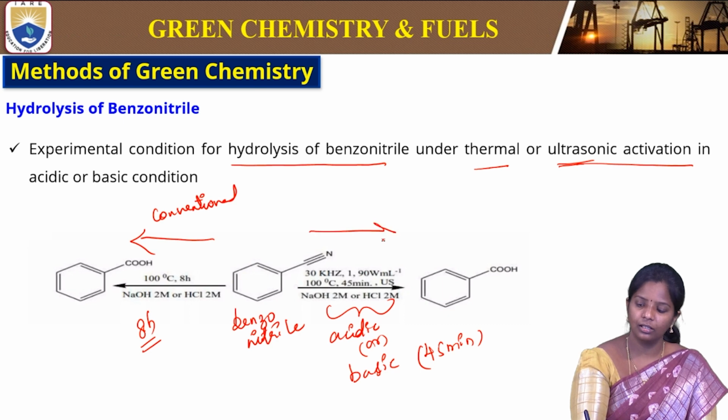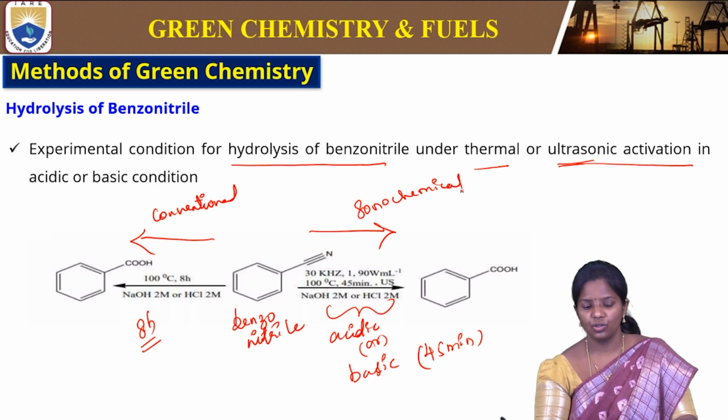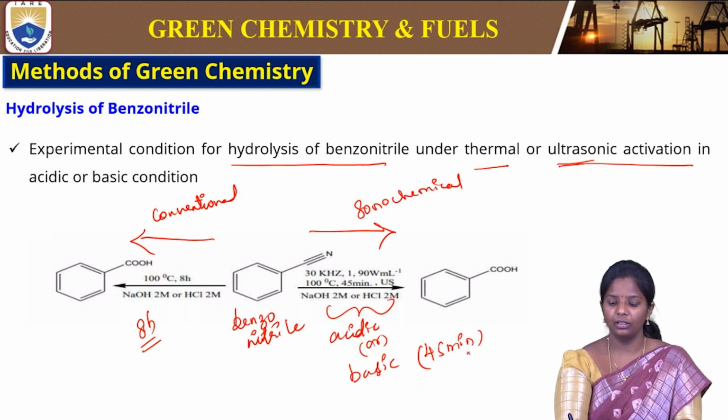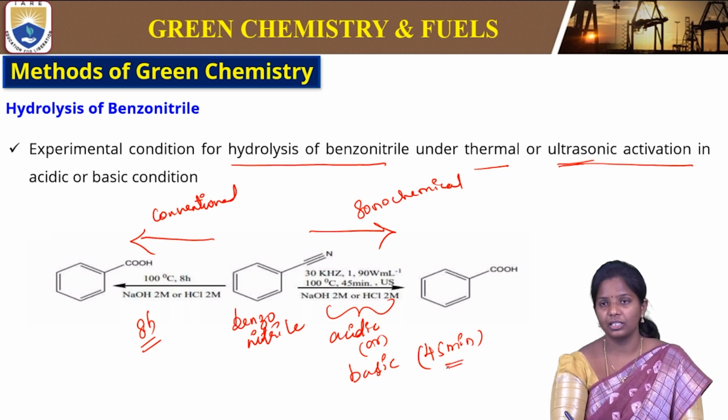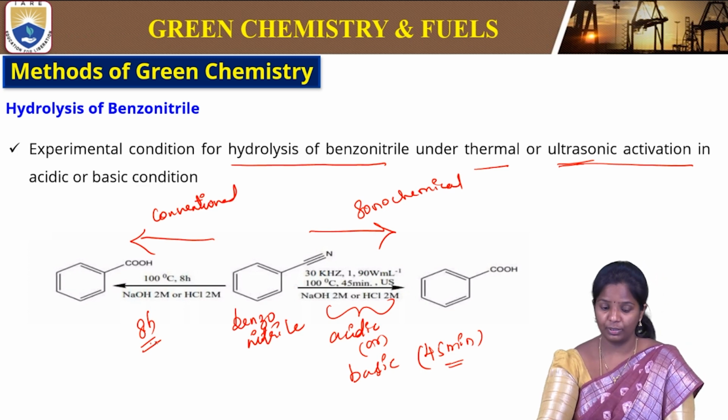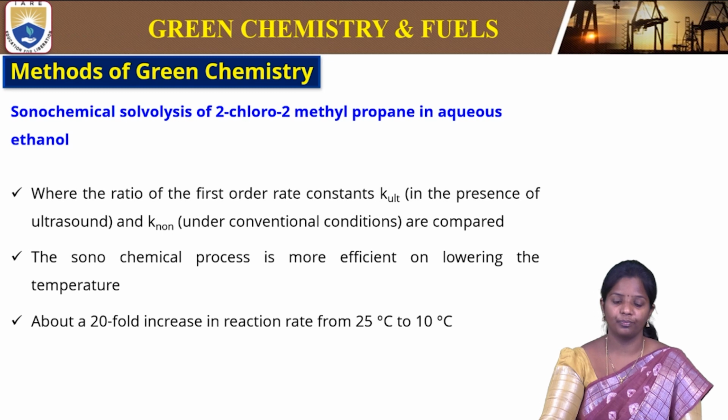This is the sonochemical method, or ultrasonic activation. So the two methods are the conventional method and the sonochemical method. Here it takes only 45 minutes, however it is 8 hours for the conventional method. So this is how the reaction time is reduced.